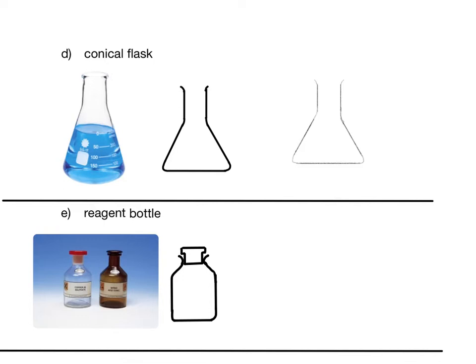And then a reagent bottle. This is difficult. So usually I would start from the top. I would start from the stopper.